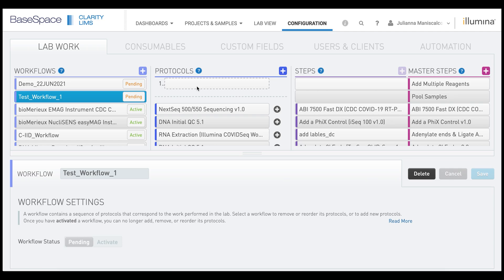You can add the protocol by clicking the gray plus button next to the protocol name.